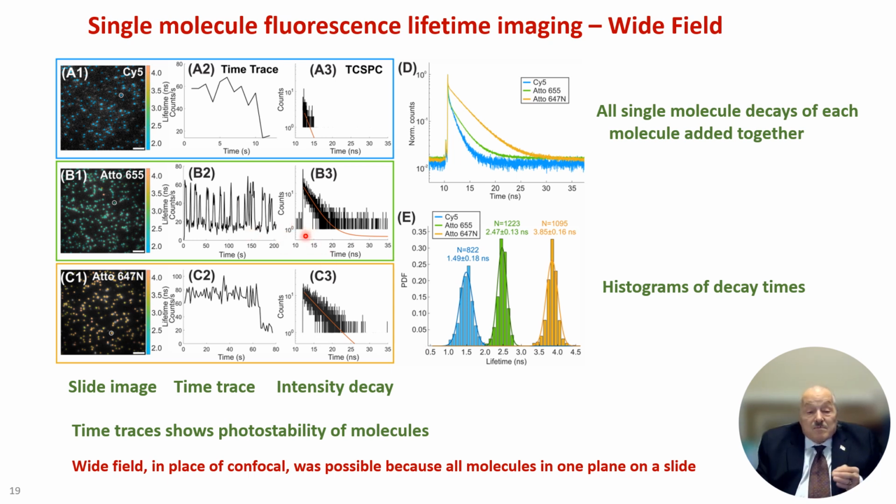Okay, so the next thing they did is they collected all of these decays together, and they got the decays of each of the single molecules alone. So they have lifetimes. I think I have them. Oh, they're in small print. I have the larger print on the next slide. So we know what the lifetimes are, and then you can make up a histogram for each of the decay times.